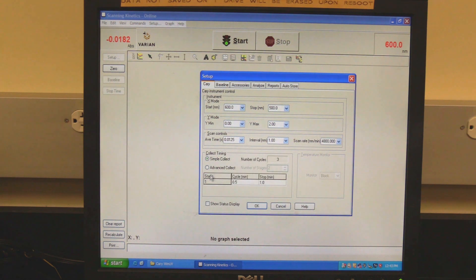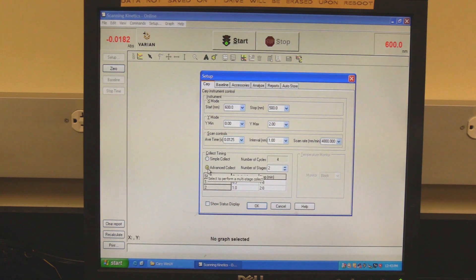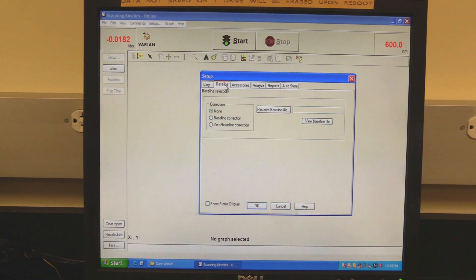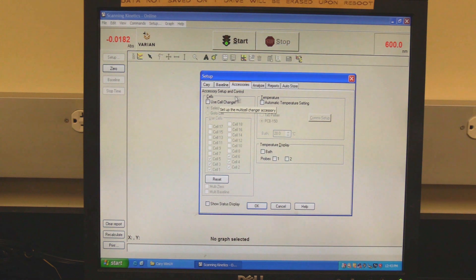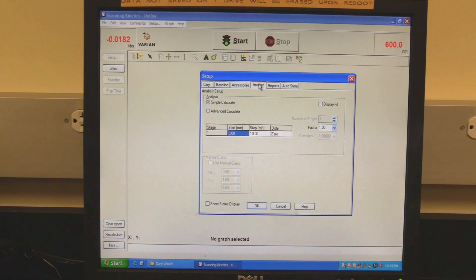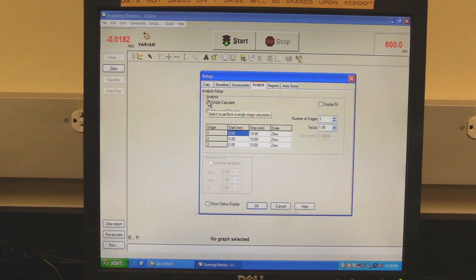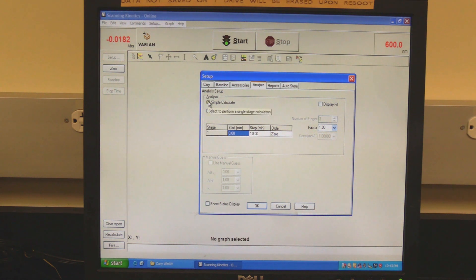In collect timing, select simple or advanced collect. Use simple if there is only one stage; use advanced if there are multiple stages. In the cycle column, set the cycle duration. In the stop column, set the end time of the reaction stage. Click on the baseline tab. To automatically subtract the baseline, select baseline correction. Click on the analyze tab. Check the auto calculate box so the software will automatically calculate at the end of the measurement. Select simple or advanced calculate. Select simple if there is only one stage; select advanced if there are multiple stages. Set the order to 0, 1st, or 2nd. Set the required factor.